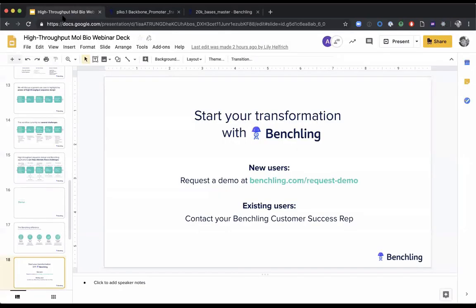Yep. Scrolling through, there are quite a few questions. I'm trying to find one that answers a lot of them at the same time. Is there a way to run sequence data alignments for the 10 different plasmids in QC in one go? That's another one where you can do this manually, but we recommend using an API to programmatically create all the alignments.